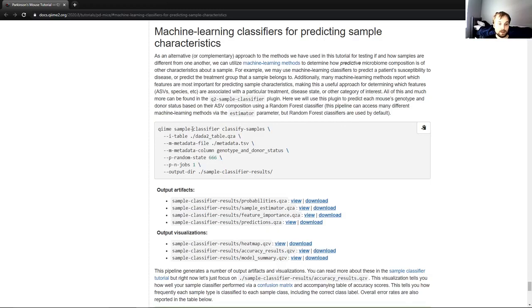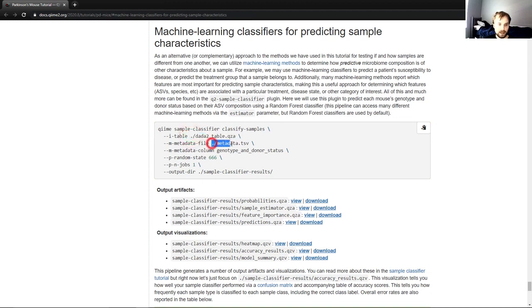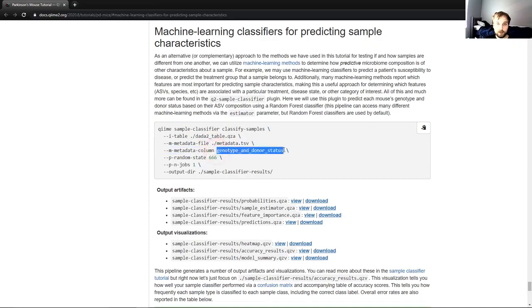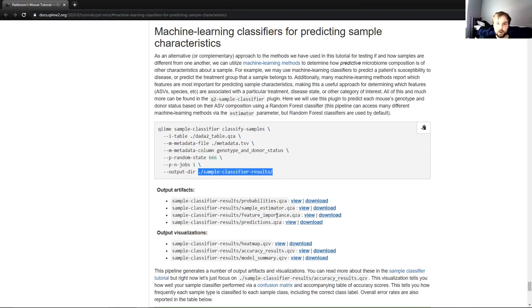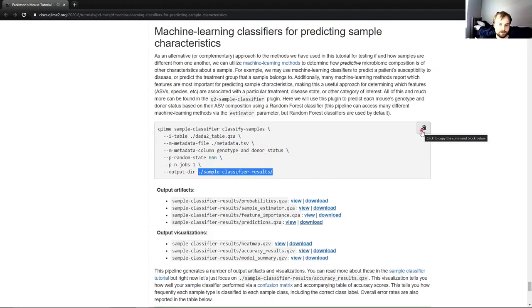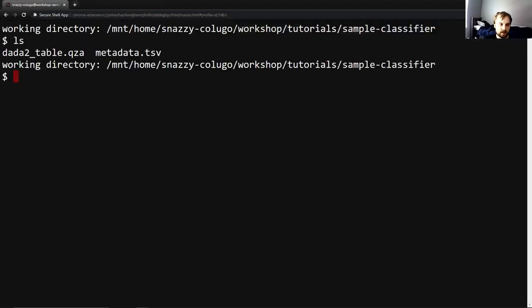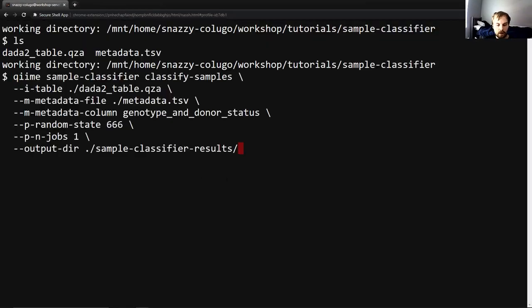So to get started, we'll be running sample classifier classify samples, which will take our feature table sequence, our tabular metadata, and also the metadata column we want to predict. These two are just some more technical information that you don't need to worry about right now. And you can see that we have an output directory, not an output file. That's because this command will actually be outputting four different QZAs and three different QZVs. So I'll copy this, paste over here and run, and it shouldn't take too terribly long to run.